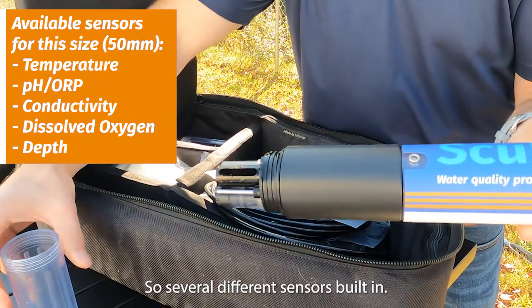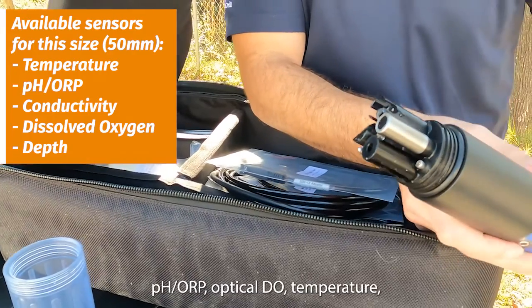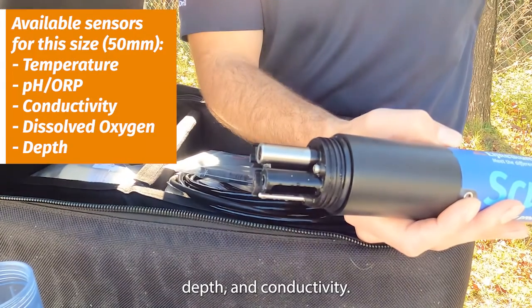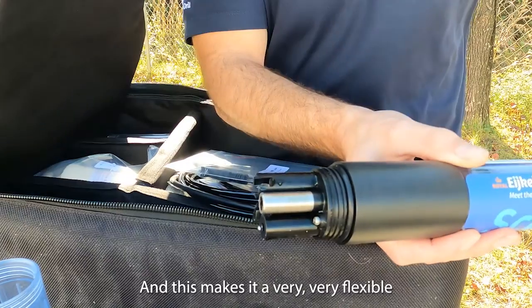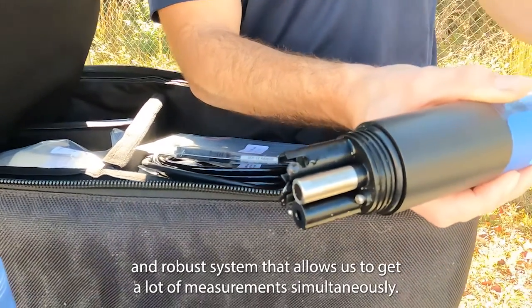Several different sensors are built in. We have pH/ORP, optical DO, temperature, depth, and conductivity. This makes it a very flexible and robust system that allows us to get a lot of measurements simultaneously.